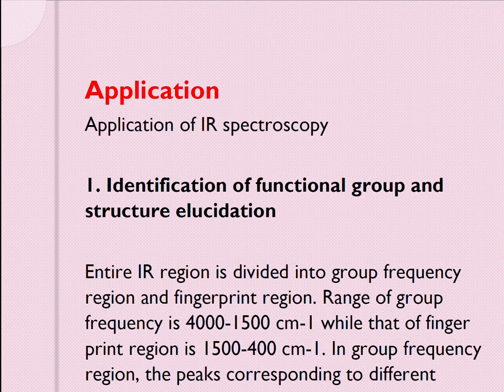Okay, but you cannot identify the sample. Again, by using atomic absorption spectroscopy, you just measure the concentration or presence of any metal or sample. Okay, but you cannot identify any functional group. So you can easily understand that IR has become very common for identification of functional groups or the compound.